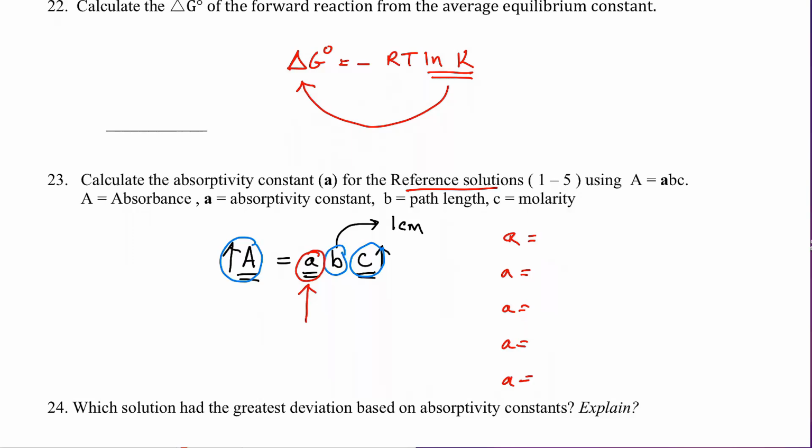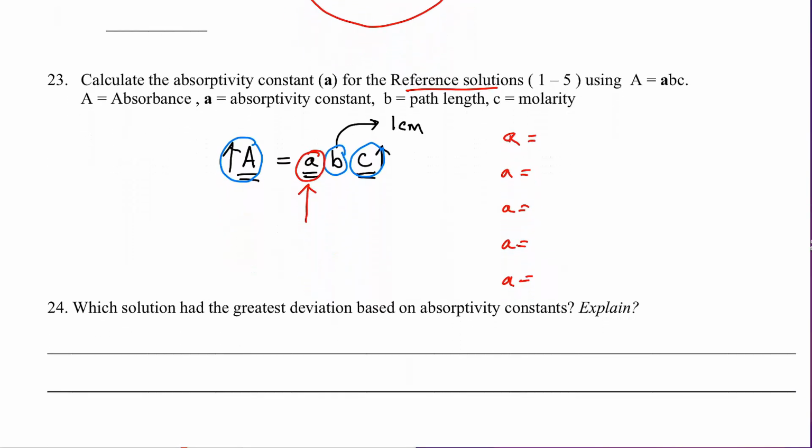And that kind of speaks to the limitations of the spectrophotometer. The spectrophotometer is trying to measure the light that was missing that came from the source to the detector, and if it's missing, it's because the chemical, of course, is absorbing it, in crystal field splitting. But there's a limitation at actually both ends. And we'll see if your data supports that. So what possible limitations does a spectrophotometer have? And see what we have there and do your best to answer that question.